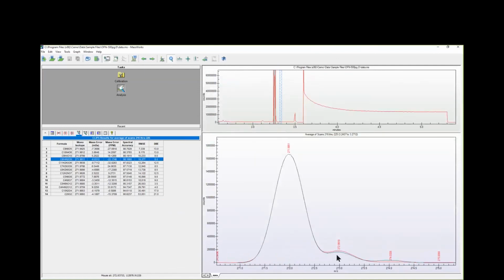And it fits. It's 98%. What that means is that 98% of this calibrated mass spectra is explained. The area fit underneath those curves is explained by this particular formula. And if I go to the best match, it's pretty good, 98.7. Again, there's very high signal to noise. Excuse me.